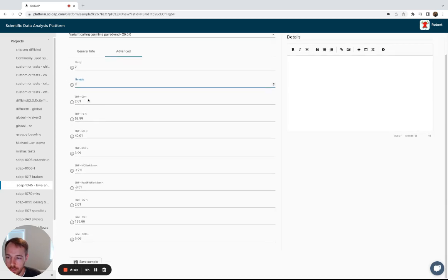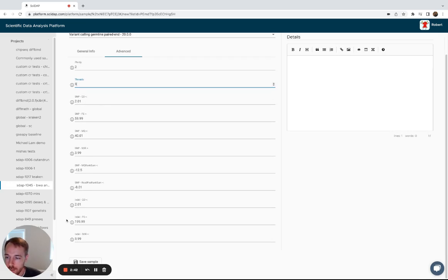And then the rest of these parameters are for the base quality score recalibration, which generally can be left alone, but you can play around with them here if you desire.